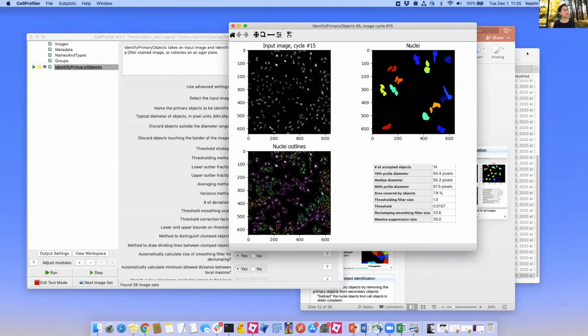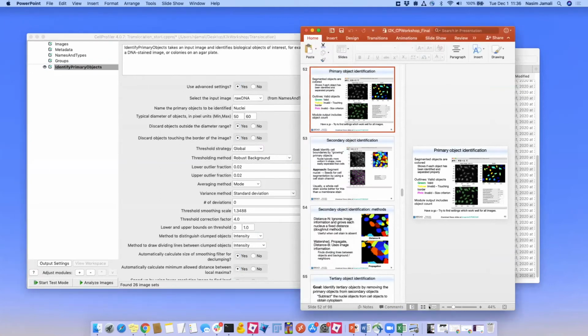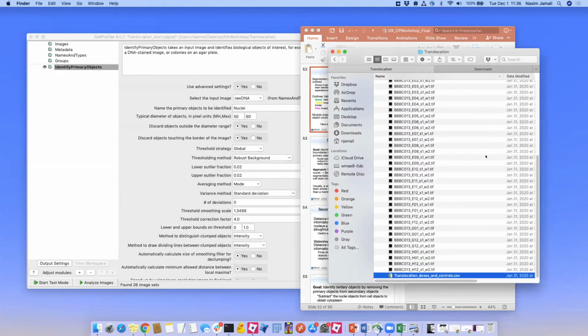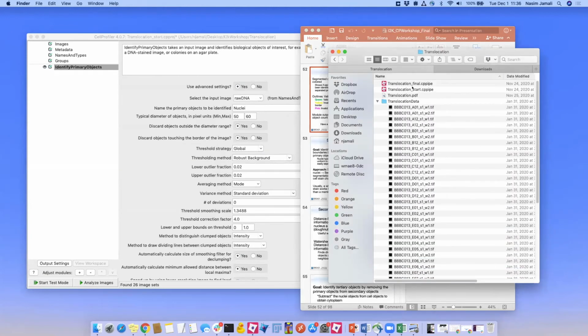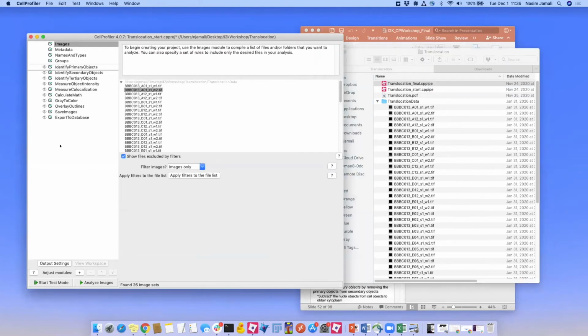And then if you follow the PDF file, all the instructions are there. But again, you would have another opportunity to work on that and the rest of the pipeline again. Okay, I'm gonna exit test mode now. And we want you to build the pipeline from the start to get to the final. But I'm just gonna load the final now. So I have all the completed pipeline.